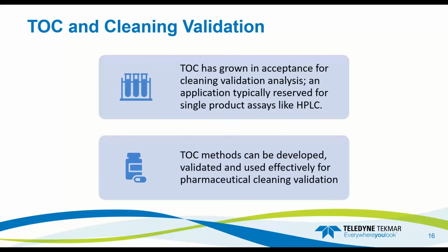So TOC has actually grown in acceptance for cleaning validation. And if there's any further investigation, that's reserved for an HPLC. TOC methods are developed, validated, and used effectively for pharmaceutical cleaning validations.